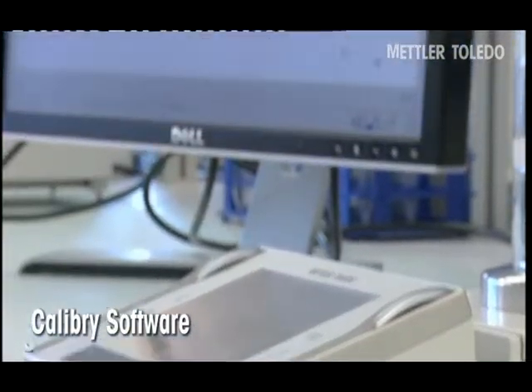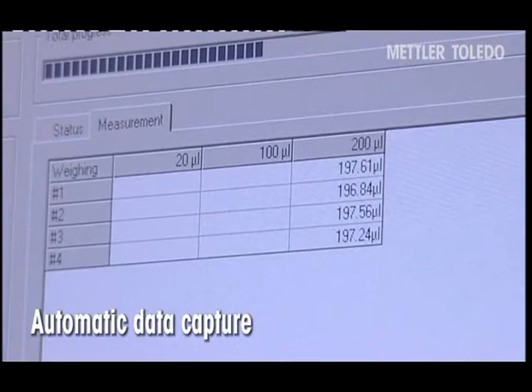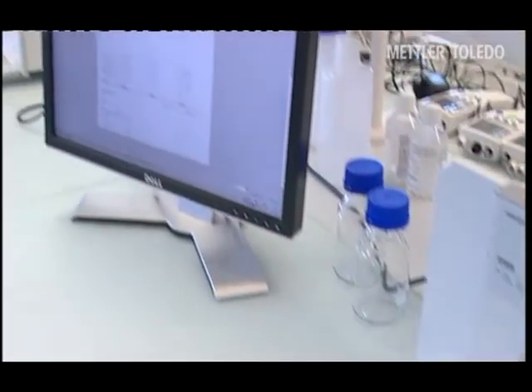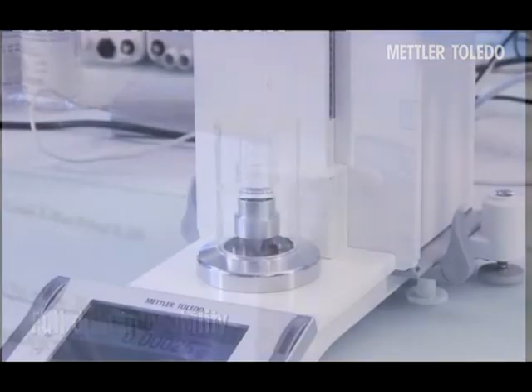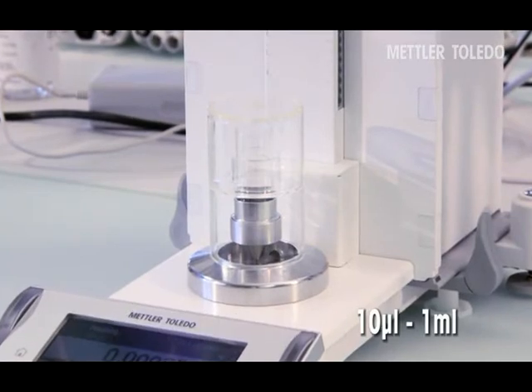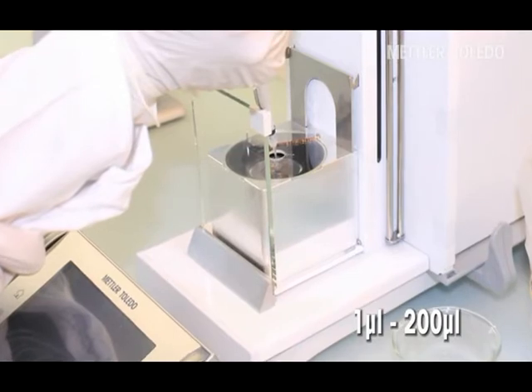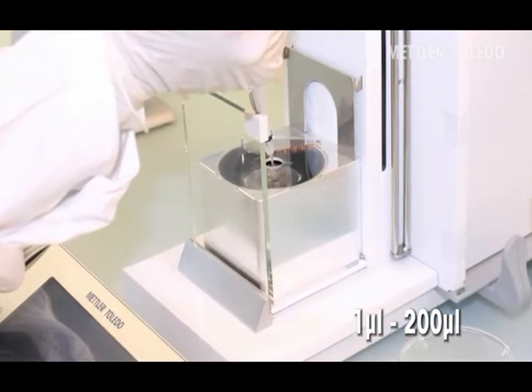Test data can also be automatically captured by Mettler Toledo's Calibry pipette calibration software, ensuring full data traceability. Simply choose the evaporation trap that corresponds to your needs — Mettler Toledo has the solution for all pipette volumes.